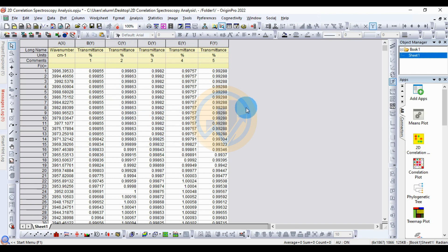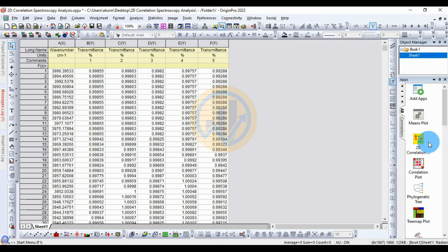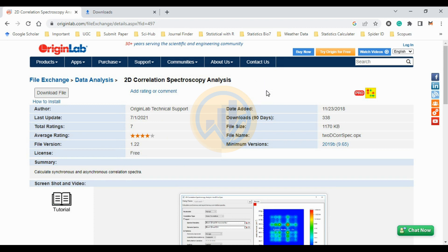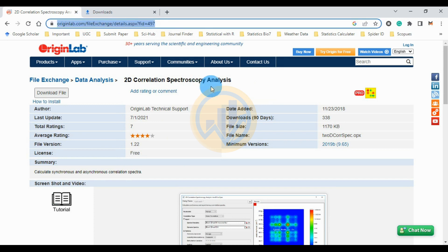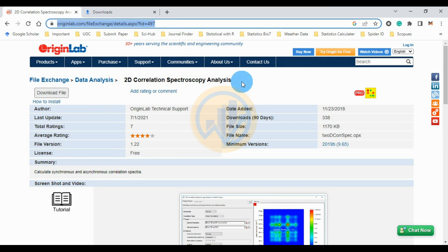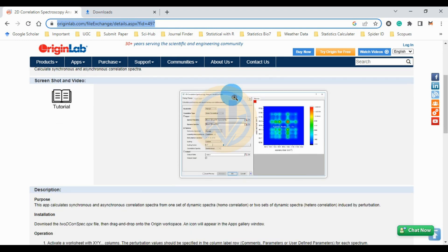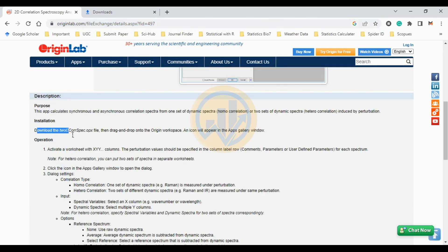Now let's create the plot for the 2D correlation spectroscopic analysis. This is the app for 2D correlation spectroscopic analysis. For the installation method, go to the ArginBro Works website — the link is mentioned in the video description box. Click the download button to download the 2D correlation spectroscopic analysis app. Then download the file and drag and drop it into ArginBro Works.